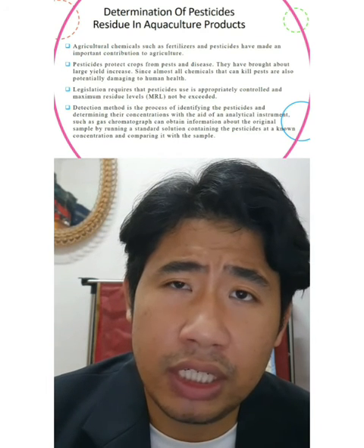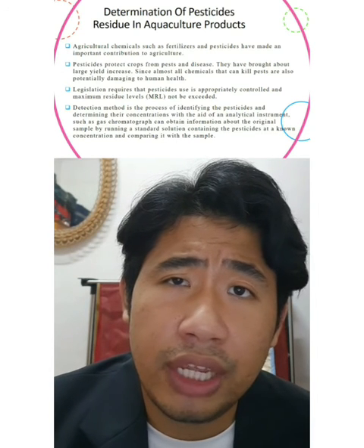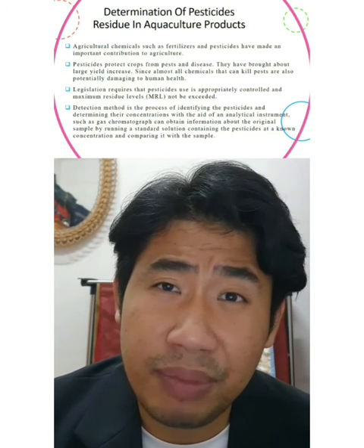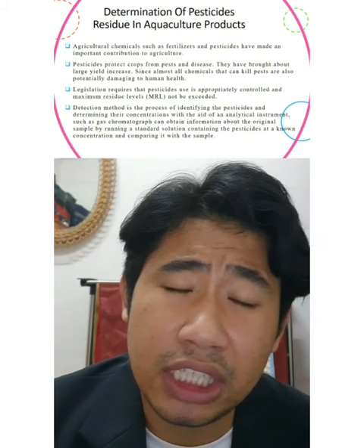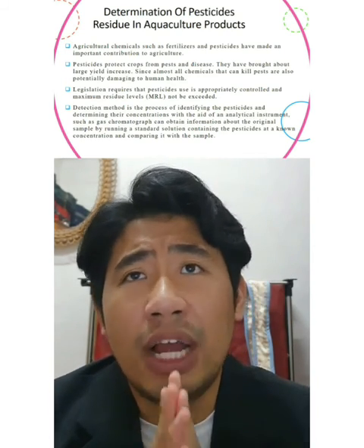I will present about how gas chromatography can improve the quality of health or the environment. Firstly, I will give an example: the determination of pesticide residue in aquaculture products. First I will talk about agriculture.